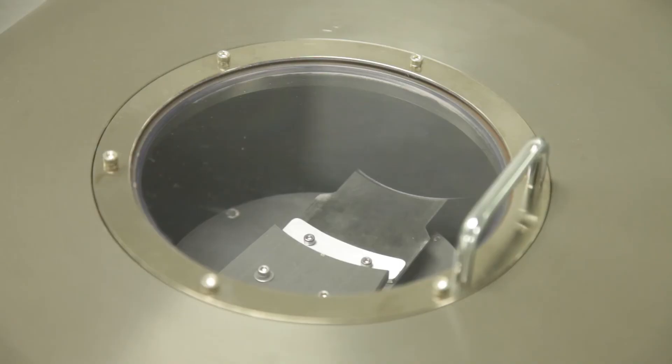The arm will place the wafer in the center of the chamber and return to the load lock. The anisotropy and rate of etching depends on several parameters, like the type of gas, pressure of gas in the chamber, and power of the sources.